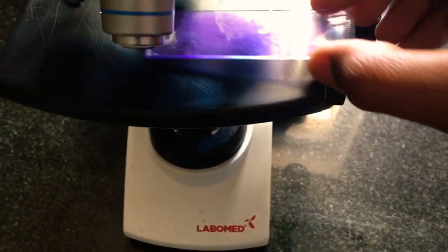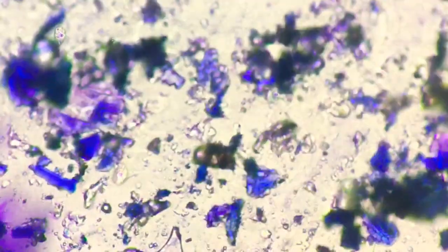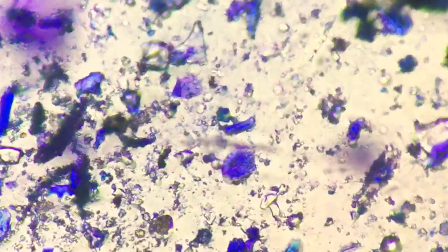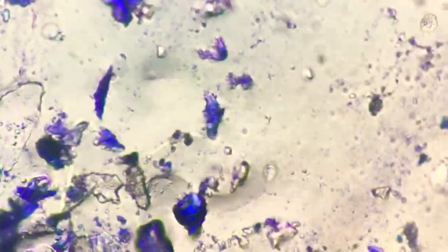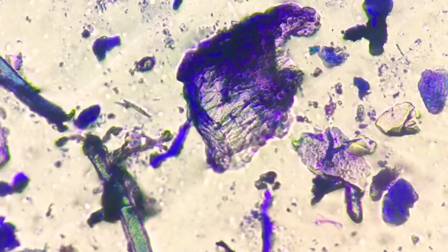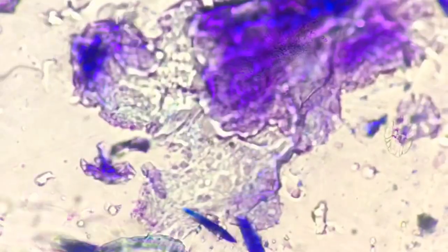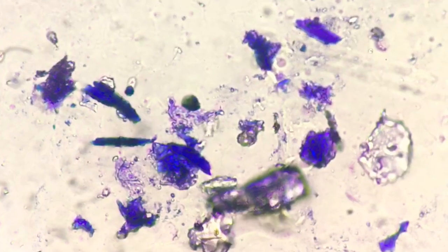Now the smear is ready for examination. Keep it under the microscope and examine it under 10x — this is how the sample will appear at 10x. The quality of the sample will be pretty much comparable to impression cytology. If you want to look at Malassezia, you can increase the magnification to 40x. Oil immersion will not be beneficial in this tape impression smear.